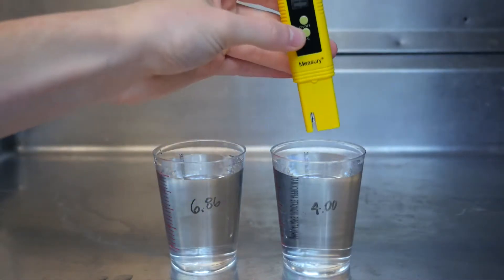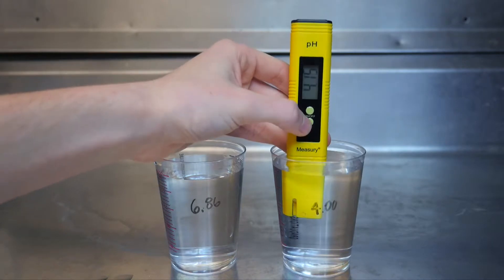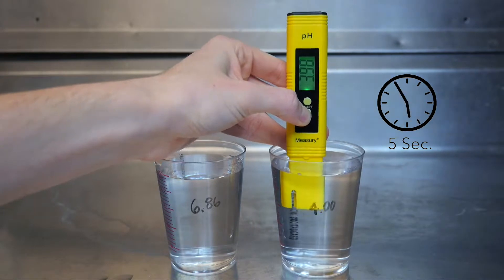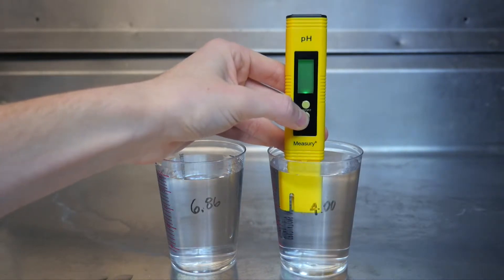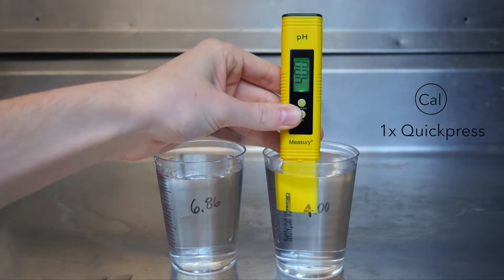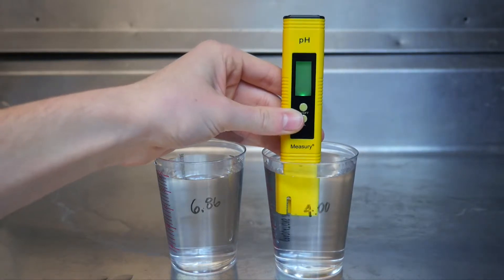Now, insert the meter's electrode into the 4.0 pH solution. Again, press and hold down the cal button for five seconds. After you release the button, 6.86 will again flash on the screen, but this time quick press the cal button and the display will then flash 4.0. Wait until the display stops flashing.